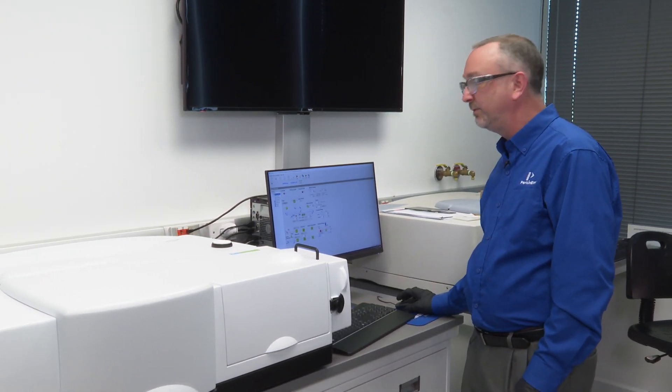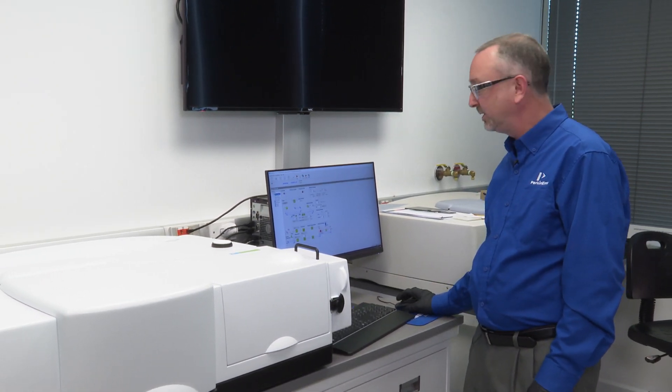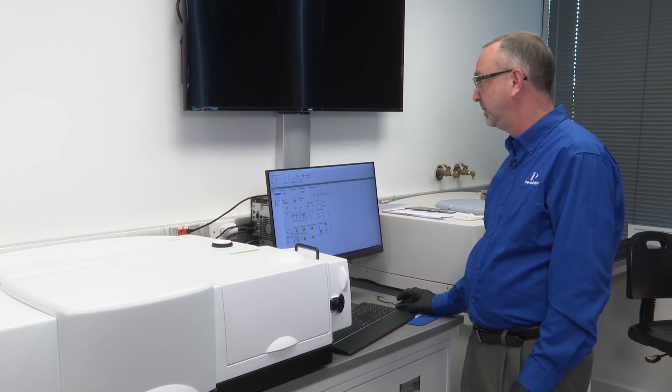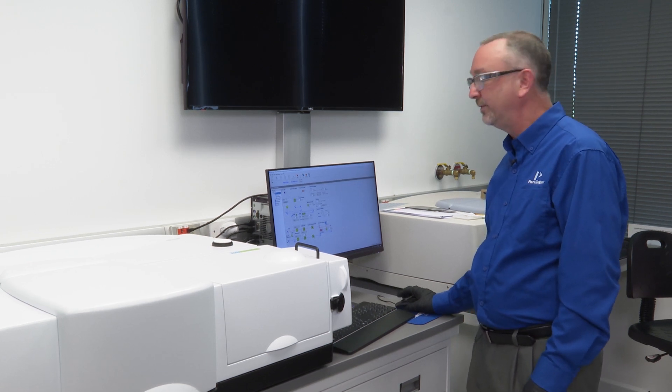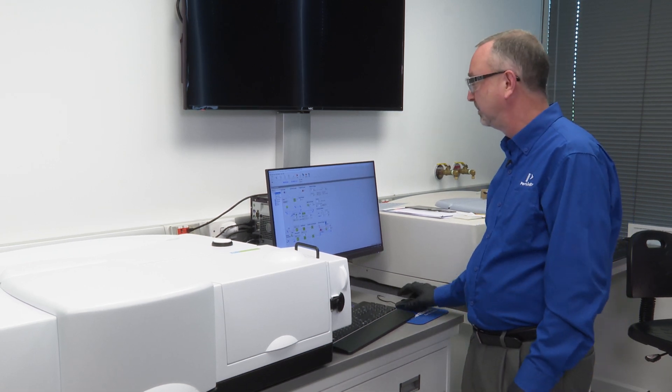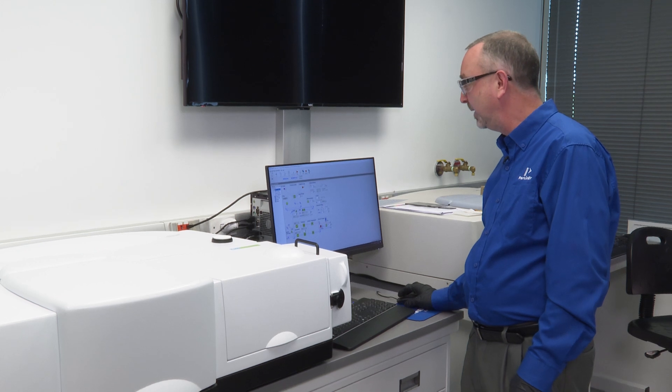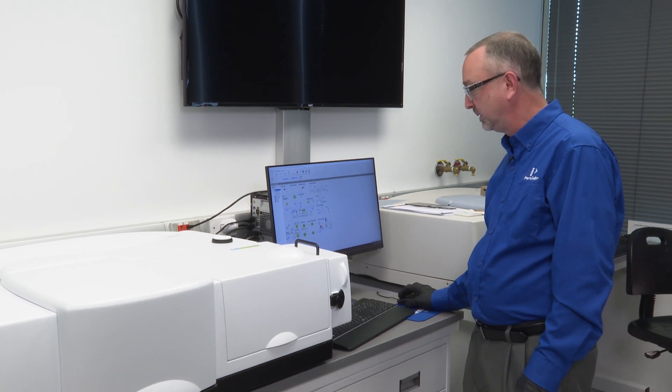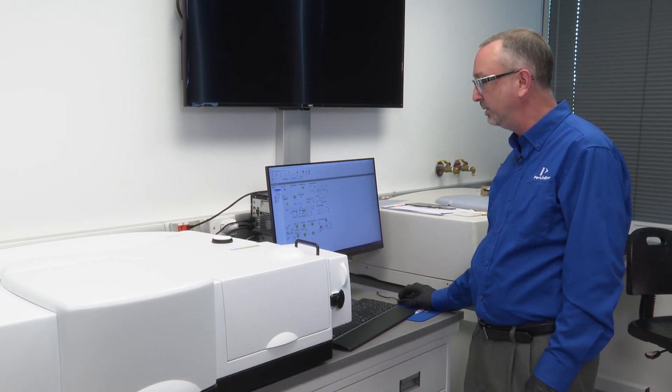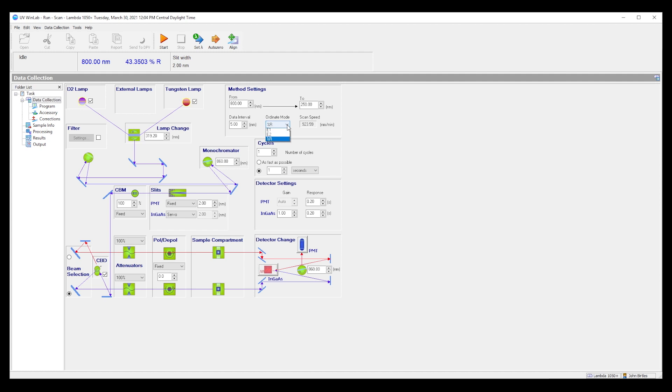Amongst the variety of data collection conditions there are several that are very important. Number one, the percent reflection ordinate mode must be selected, percent R.